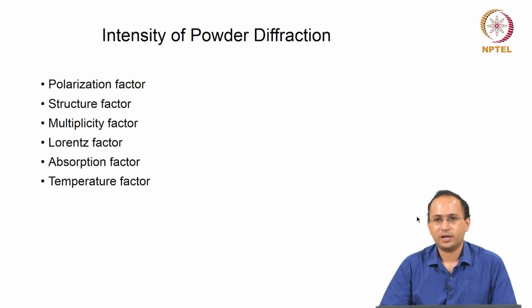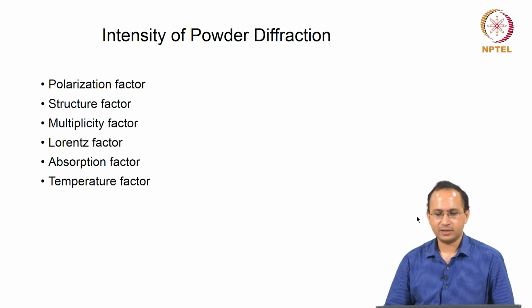Hello everyone. So, we will continue our discussion on X-ray diffraction. What have we learned so far? First of all, starting from how X-rays are generated, and how we make use of X-rays to understand the material. Basically, we discussed how we get the characteristic spectrum.